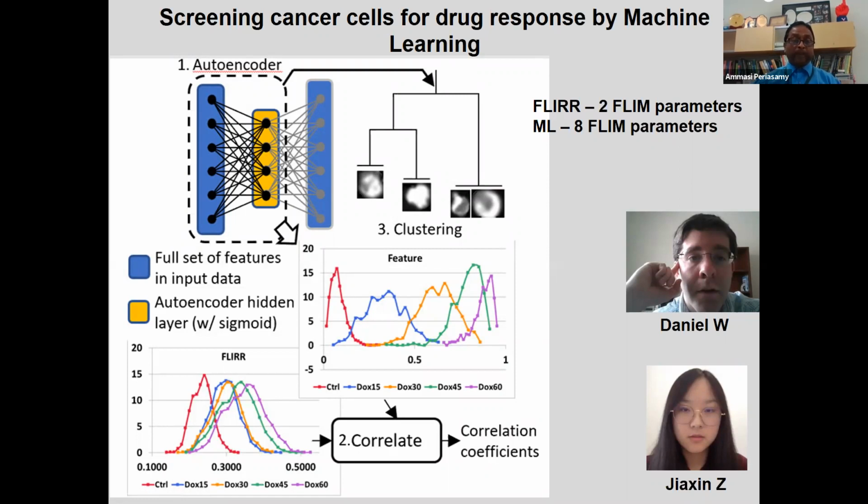It takes more time. More importantly, you can get it quickly with 30 minutes drug treatment instead of 60 minutes drug treatment. You see that with 60-minute drug treatment, the cell morphology changes. So this helps a lot. We are working on this right now.